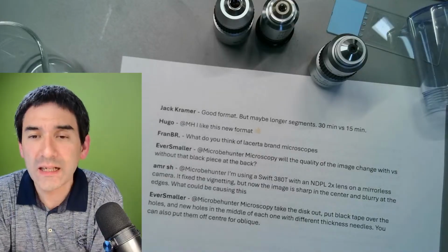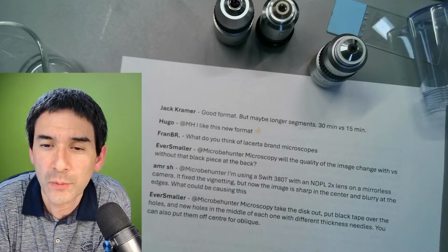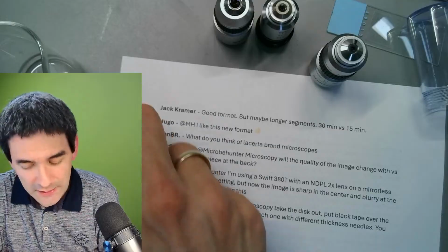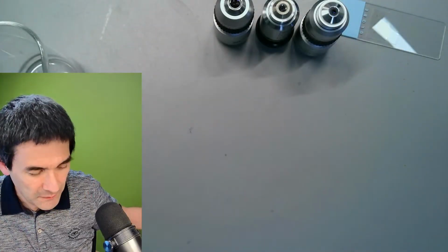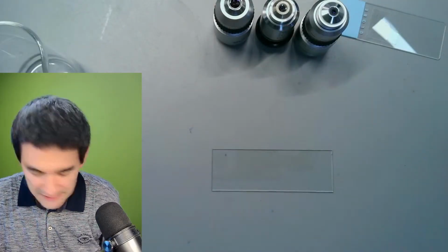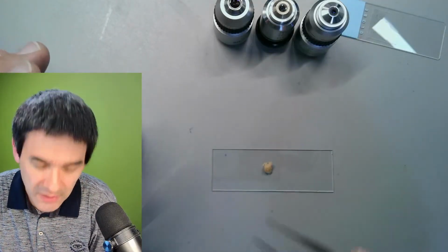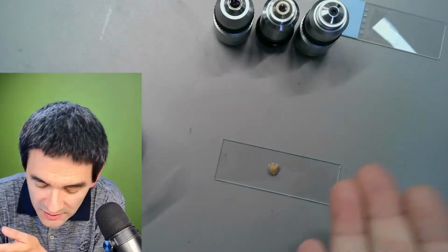I've been actively debunking these fear-mongering microscopy channels. Funny thing, they often use compound microscopes, but then show stereomicroscopic images. Honestly, there is this one channel, and I say, gee, why even bother to make videos if you don't want to do it properly? Maybe I'm being a little too critical. They show you the microscope slide, and they take a sample, a huge one, put the whole thing under the microscope, and then show you something. No, you're not going to see anything like this.